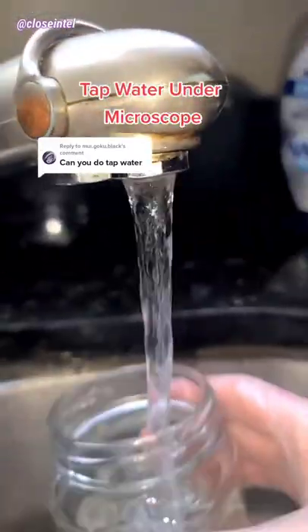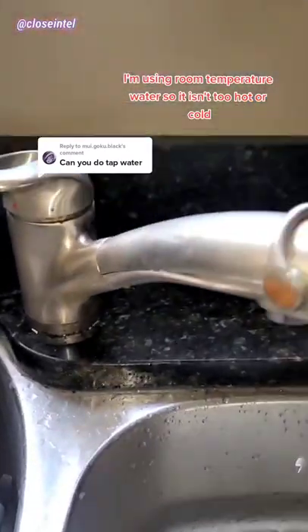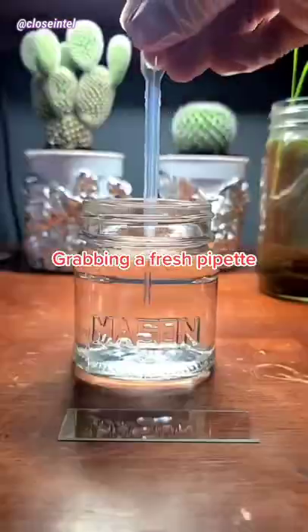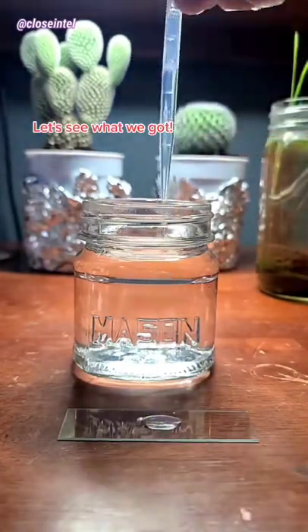Tap water under the microscope. I'm using room temperature water so it isn't too hot or cold. Grabbing a fresh pipette — let's see what we got.